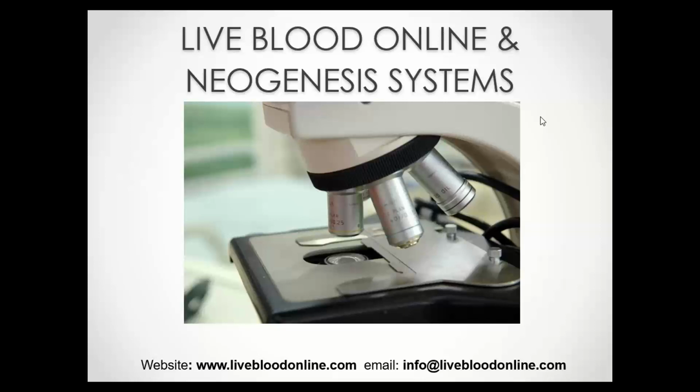With regards to actual research, there have been a number of small studies that have shown a very strong correlation between the findings in live blood analysis and conventional blood tests. Because live blood analysis is much more sensitive than conventional blood tests, this is not something that can be done for all live blood analysis anomalies, but in some of these studies, they looked at anomalies that can be easily detected in conventional blood tests.